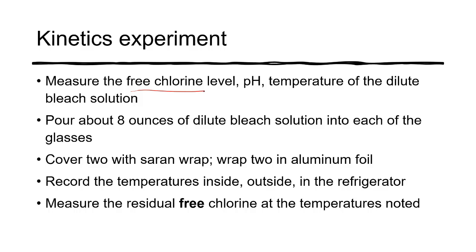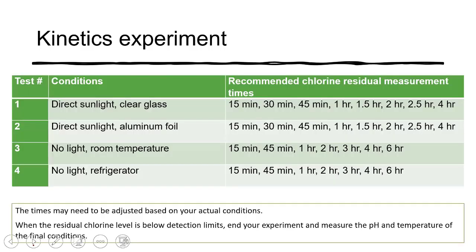And then what you'll do is essentially you'll set it up and then you just have to let the experiment sit, okay? So you will measure the decay in direct sunlight, so it's good to do it on a nice sunny day like today. Again, you're going to do that in the clear glass, so you want that wrapped in saran wrap, or at least covered in saran wrap.